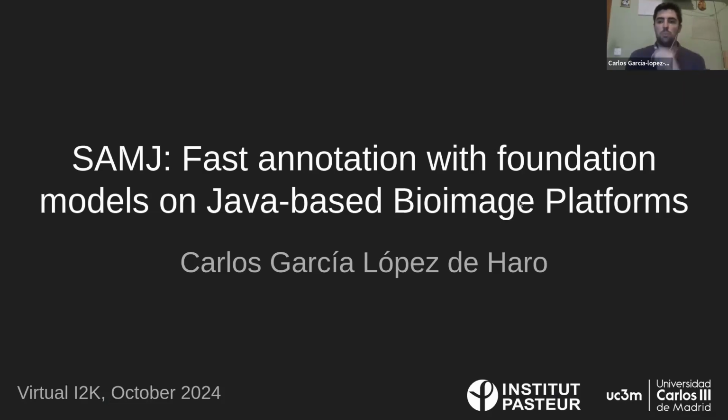I work at Institut Pasteur and at Universidad Carlos III de Madrid. And I'm going to present the plugin that I developed for Fiji and for more Java-based software with many other people, called SAMJ. The idea is that SAMJ enables fast annotation using foundational deep learning models, AI models, on Java-based bioimaging software.